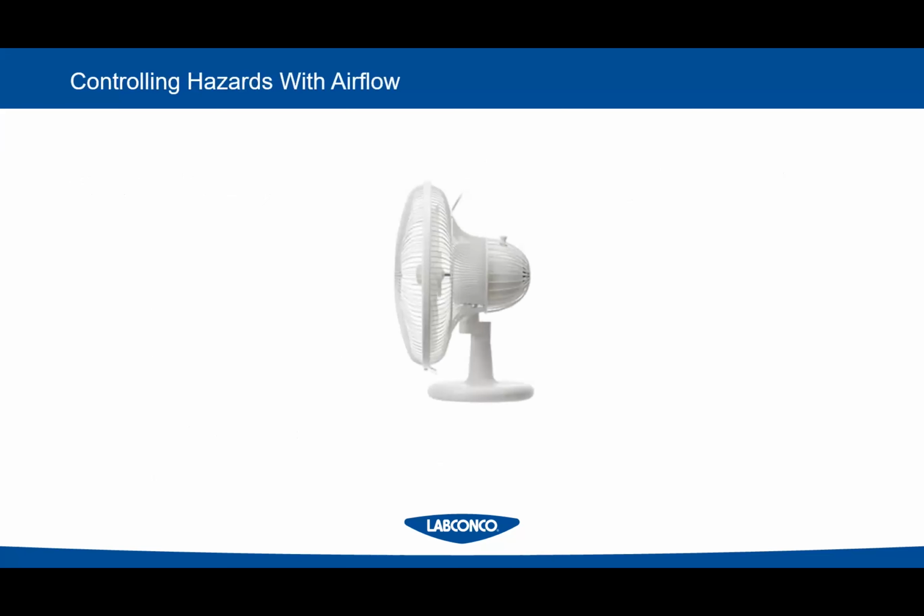So how do we control hazards with airflow? And I apologize if this is very basic for some people, but I like to think about which way the wind blows, right? Because my products do a lot of different things. It's not just about protecting people, right?